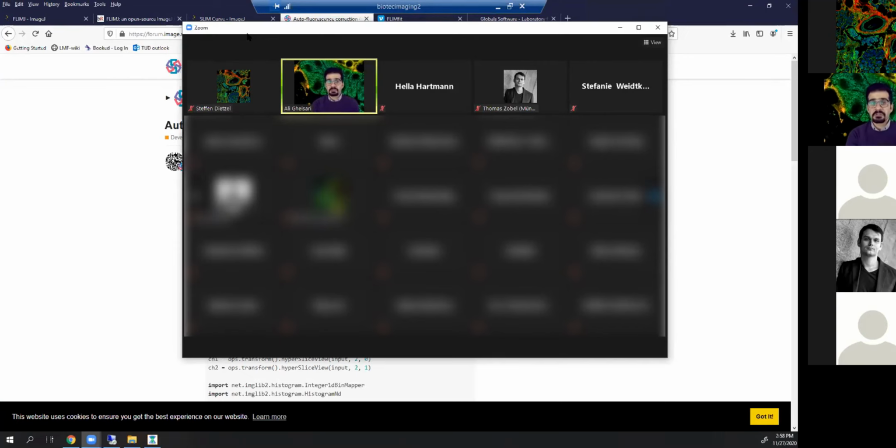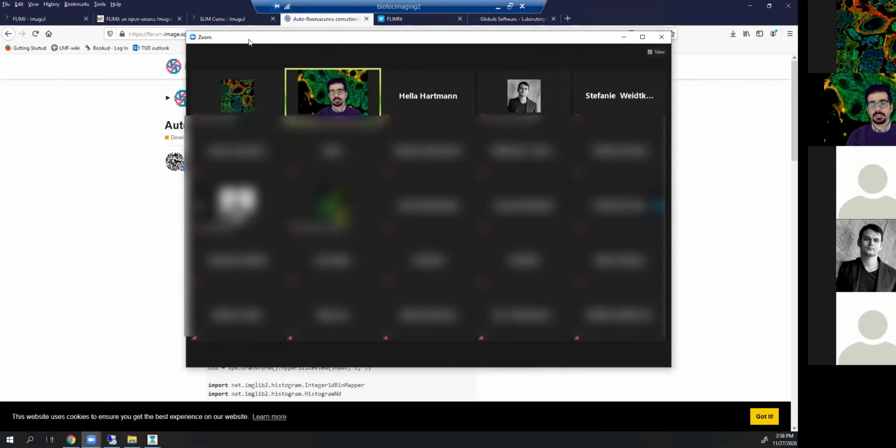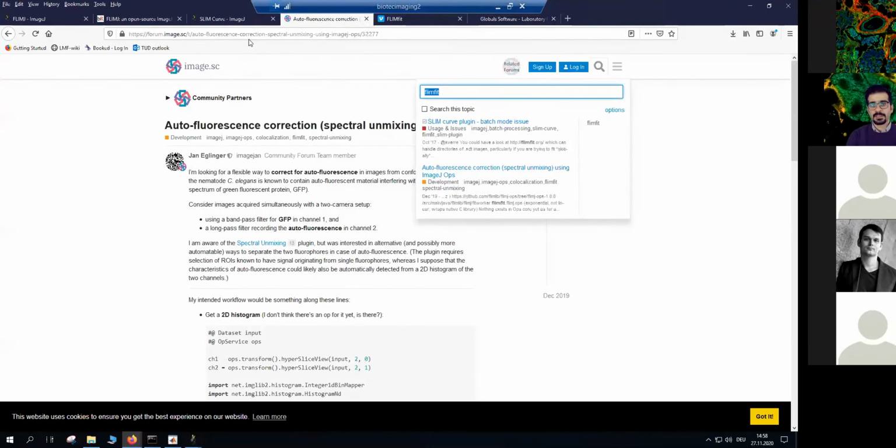I just go there, Googling that or checking in the search bar of image.sc. So I just search whatever I want. If there is the answer that I need, that's perfect. If not, I can just open a topic, and typically my personal experience says that I get the answer in a day or two at the latest. Okay, let's go back to the questions.